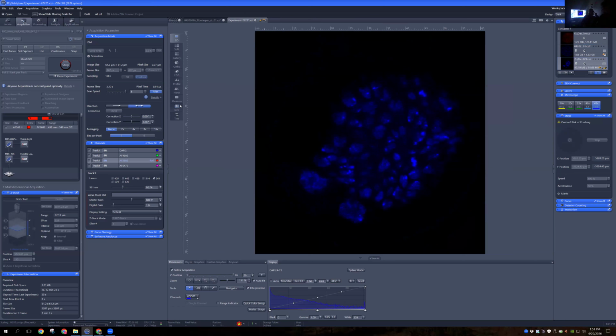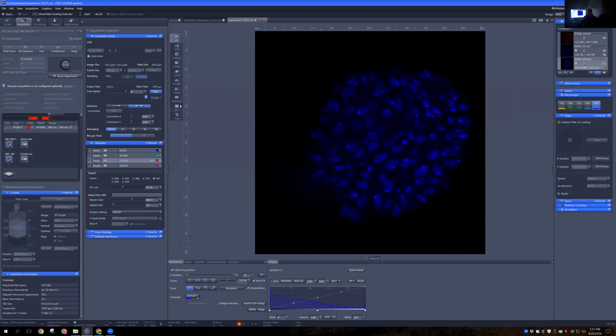Michaela, you have something? No? We've just set our third acquisition for the session. Yeah, but this is a great conversation. Yeah, I'm curious actually, Michaela, what is the variable that you're manipulating here?